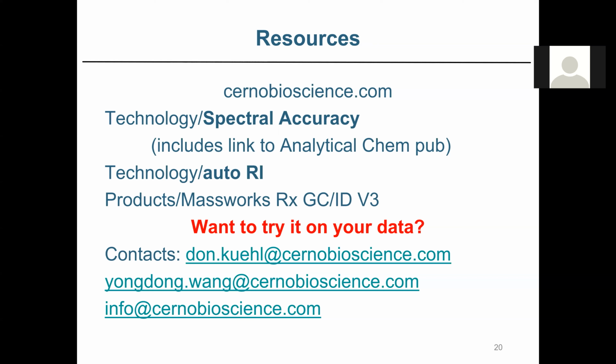From that we can certainly identify the molecular ion, and then you can identify a bunch of the fragment ions. So you get the molecular ion, the formula, and the fragment ions. Then you can start to get some clues as to what the structure might be. But it's a tedious process, and that's what people have to do to identify real unknowns. And ultimately you wind up synthesizing the compound and seeing if it is the same chromatographically and spectrally.